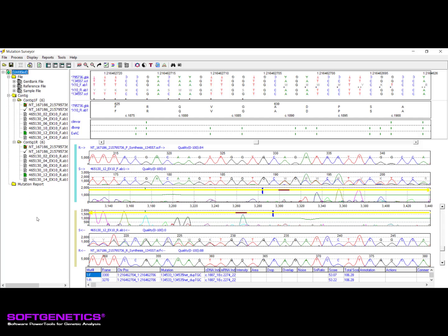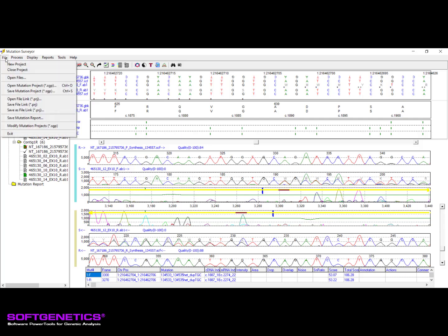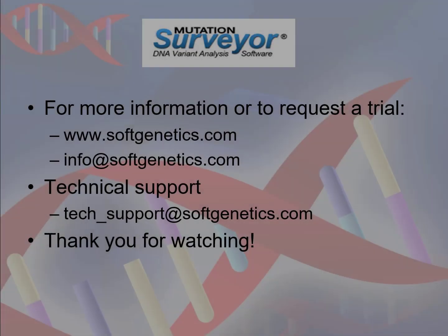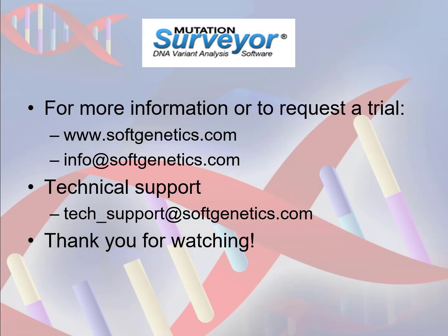A project file can be saved and reopened any time to allow resuming of the analysis or review. The project saves all of the last used settings for analysis and reporting, as well as any edits to mutation calling to make sure nothing is lost. This has been a short demonstration of the Mutation Surveyor software workflow.